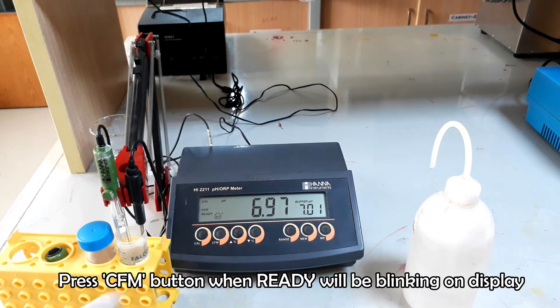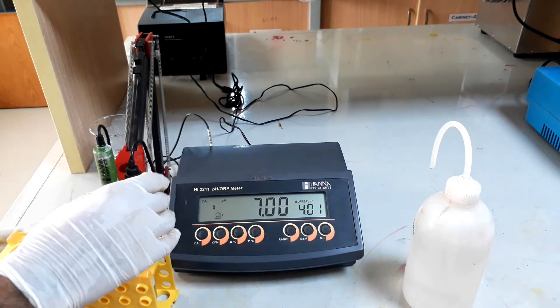When the ready word will be blinking on the display, press the CFM button quickly. Now remove the probe from the buffer 7.